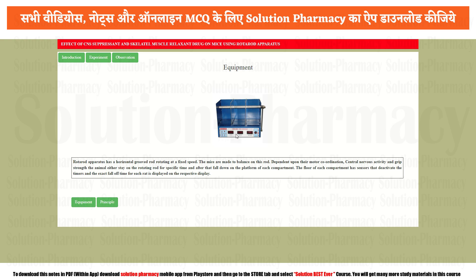The basic parts of this instrument include the indicator, which is actually a timer, the plate, the rod, the motor, and the rubber shaft that rotates the rod via the motor. When you start the experiment, the timer starts automatically and the rod begins rotating. Once the animal is placed and starts rotating with the rod, the counter runs continuously. But once the rat or mice falls down onto the plate — which has a small button beneath it — it pushes the button and the counter stops. This recorded time indicates the maximum duration the rat can maintain its grip and muscle contraction. Once you administer a muscle relaxant drug, the animal loses its grip and falls down in a shorter time. This is the basic principle of the instrument.